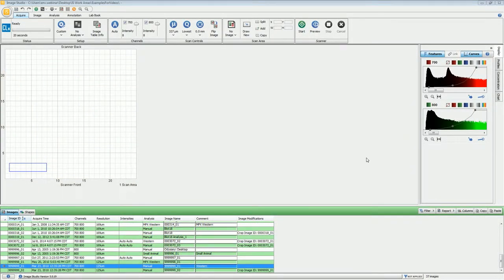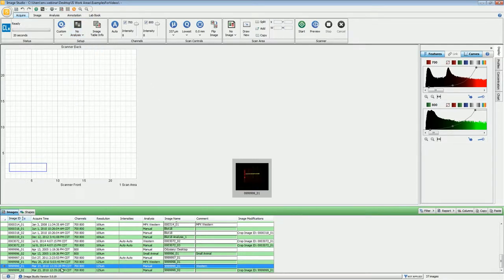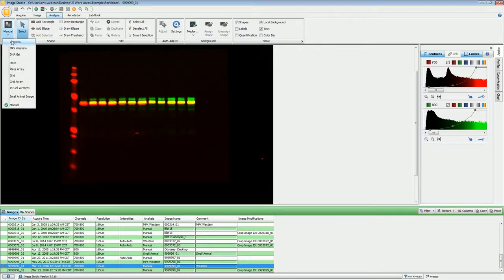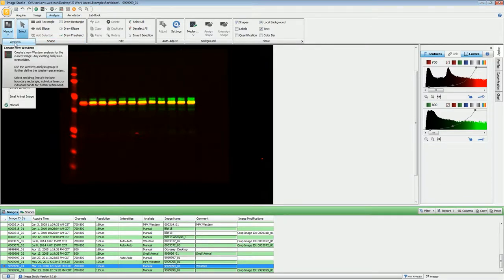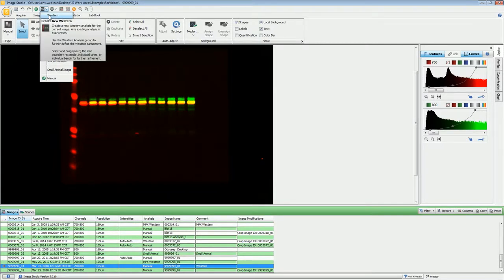In this video we'll be going through the steps of doing a Western analysis. When you first do an image acquisition you can preset the analysis type to Western by choosing this pull-down right here. You can see all the different analysis types available, but if you have not preset that, you can go to the analysis ribbon and under Type change the analysis type to Western. There is also a pull-down menu available up here that you can choose as well.